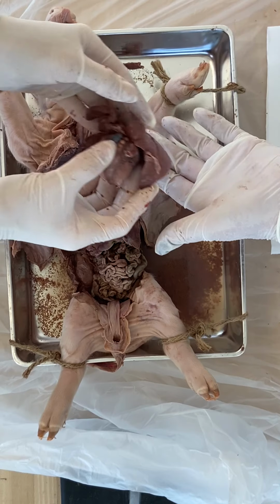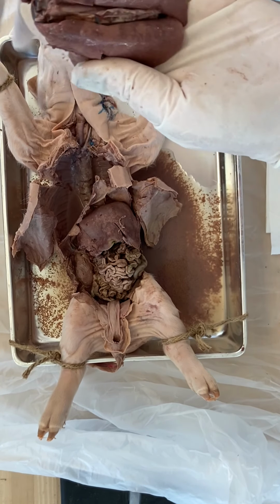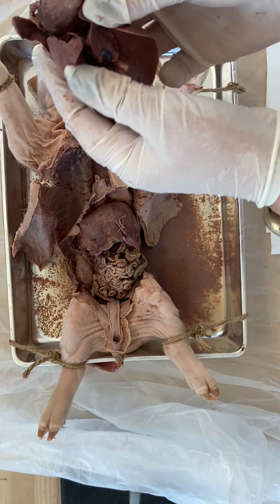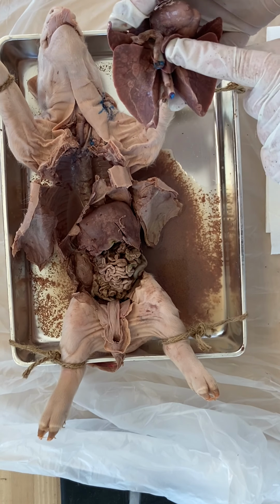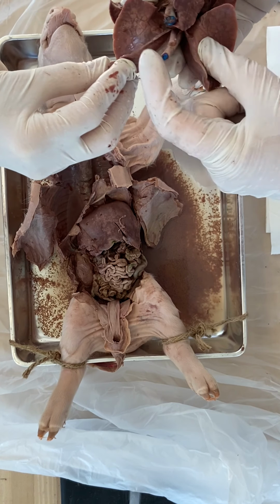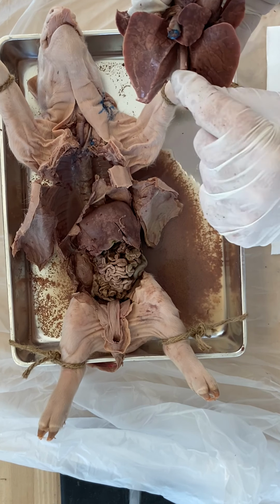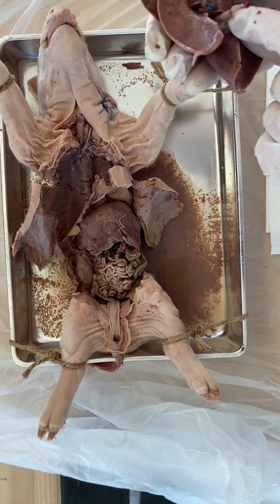You can see more of the lung formation now as well. If we go up to this side, if he's on his back, there we go, you can see his lungs come down the side more. And then at the bottom here, we decided this is the vena cava. This one is the esophagus, and you can see it is a closed tube, and this one is the descending aorta. You can see the red there in the descending aorta.